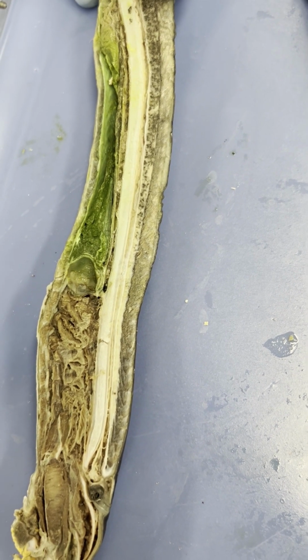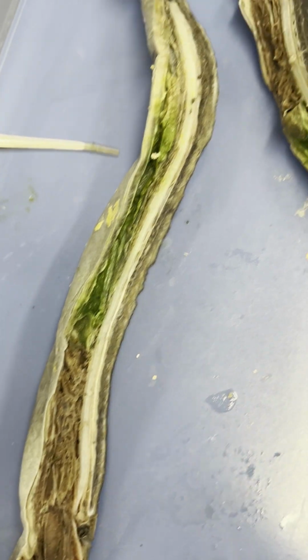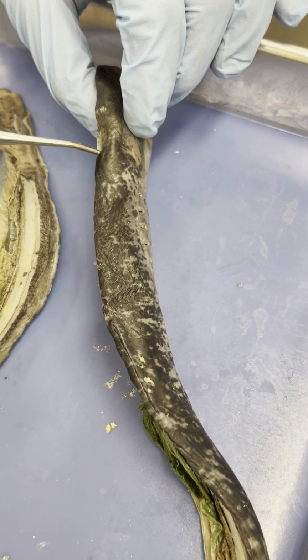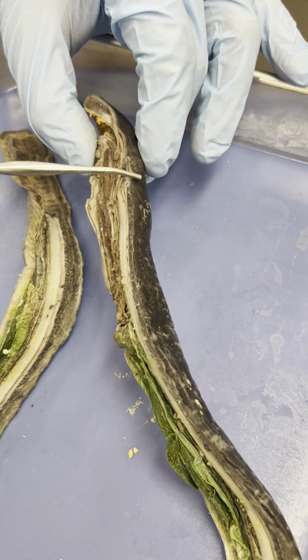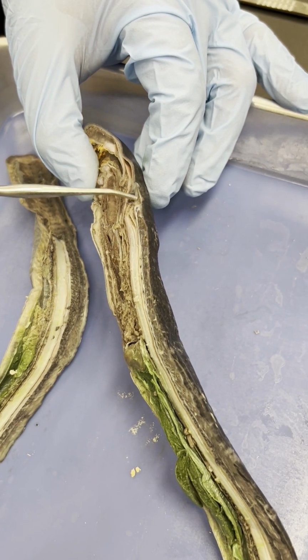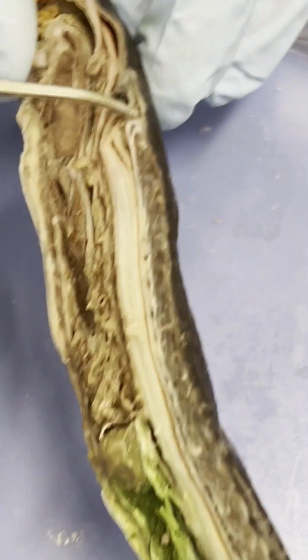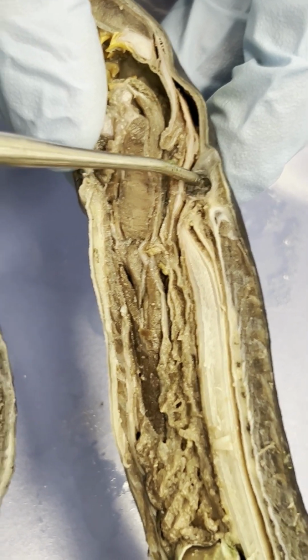So we did heart, we did pericardial cavity. Let's go now to the pineal gland. If you guys recall, the external structure is this white kind of structure on the dorsal part of the head. Now that we did a sagittal cut, we actually could see the dissected version, the sagittal cut of the actual pineal gland, okay? Pineal gland right there, our brain is right here, but now let's actually talk about this.